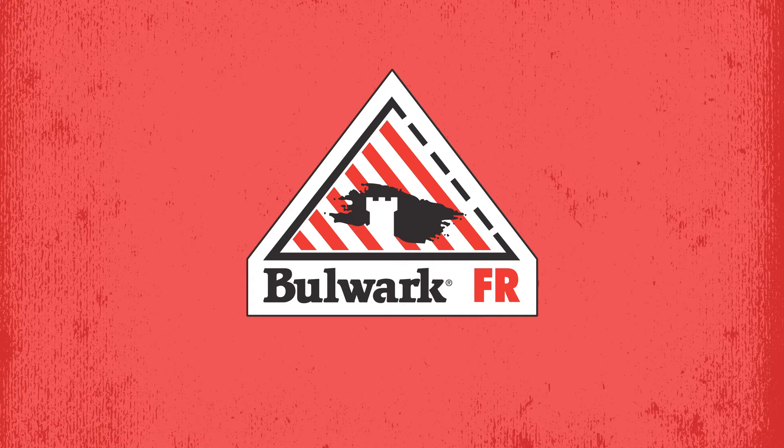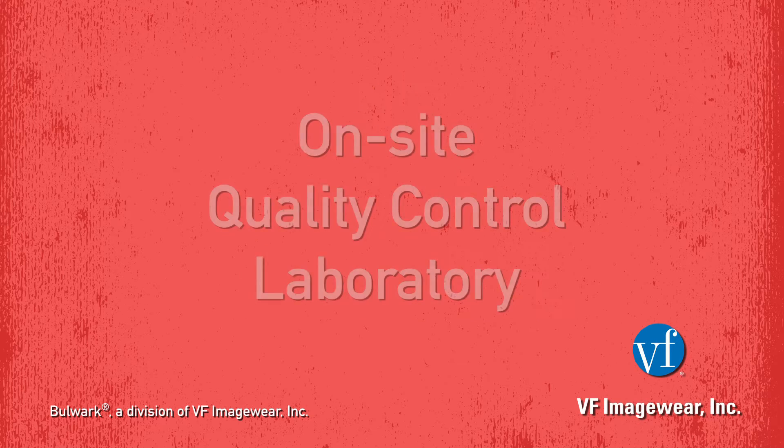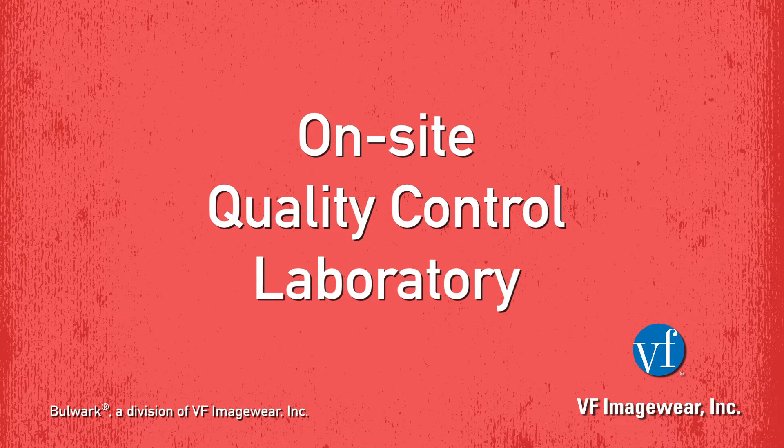Bulwark Protective Apparel presents the Vertical Flammability Test, Method 5903.1, a federal test standard 191A, flame resistance of cloth vertical. The ASTM version of FTM 5903.1 is standard test method D6413. Bulwark is a division of VF Imagewear, Inc. All testing was performed at VF Imagewear's own on-site QC laboratory.